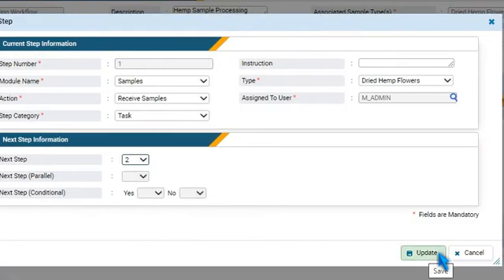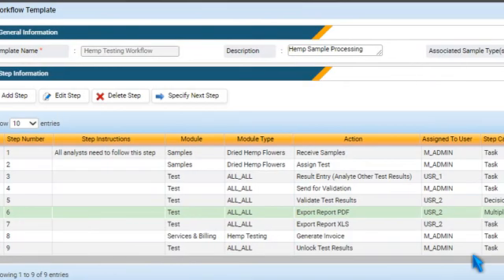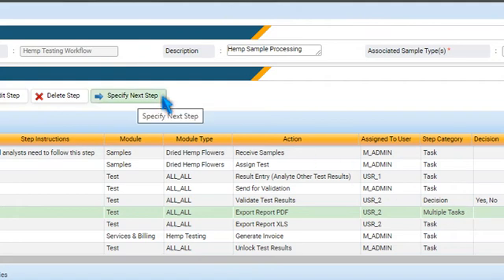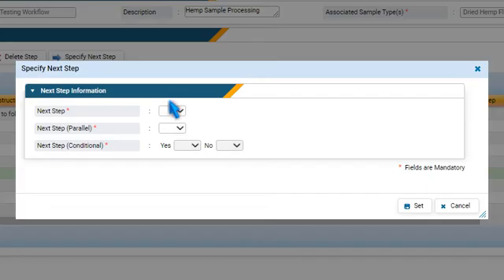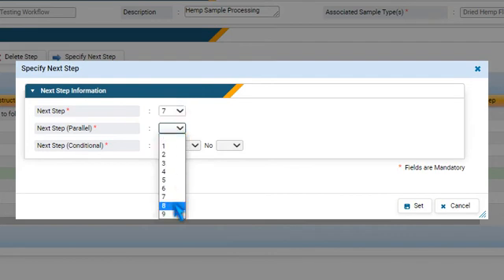For steps belonging to the Multiple Tasks category, it is mandatory to select a parallel step. This way, you can open up two tasks to be performed at the same time.